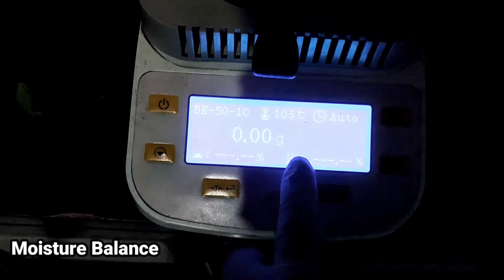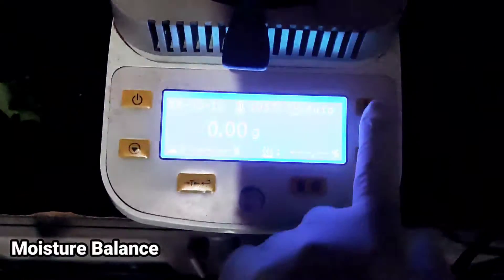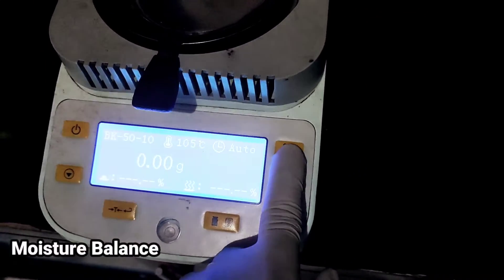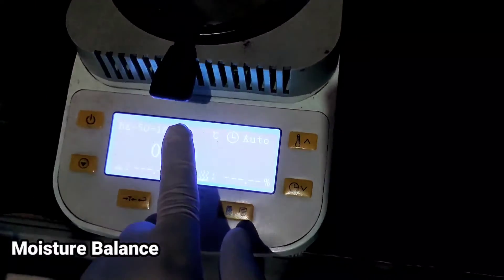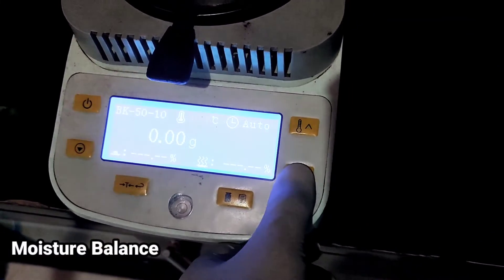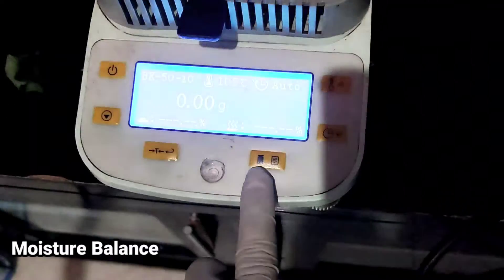Untuk mengatur suhu yang di sini, kita bisa tekan tombol suhu. Kita mau pakai berapa, kita atur — sekarang 103 atau 105. Setelah itu, oke.